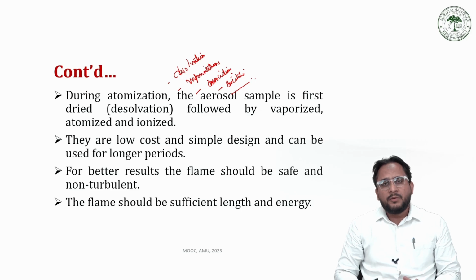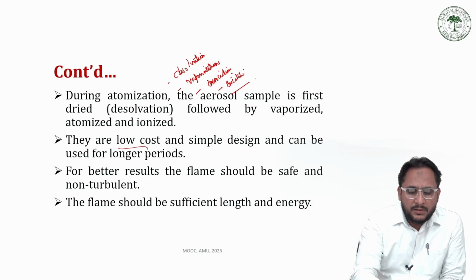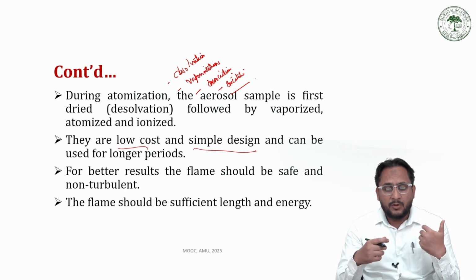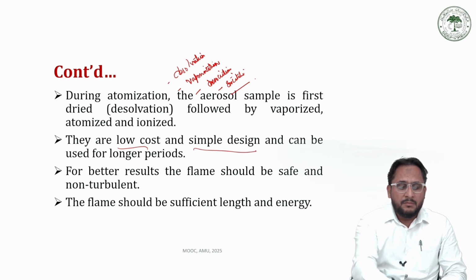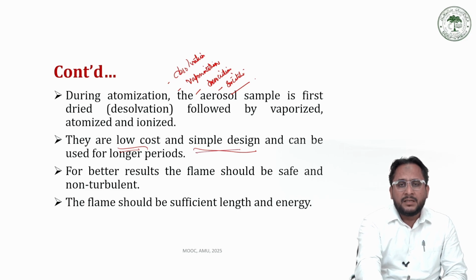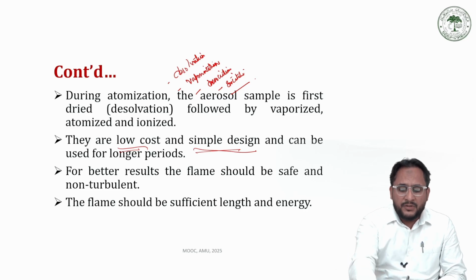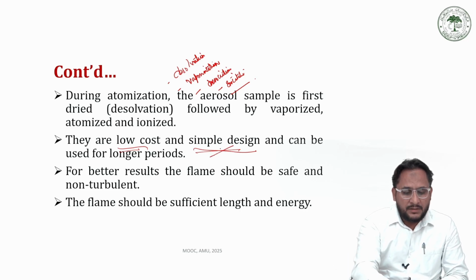Although these flame atomizers have limited energy, they are still low cost and they have a simple design that does not require a highly trained person for operation of these atomizers.